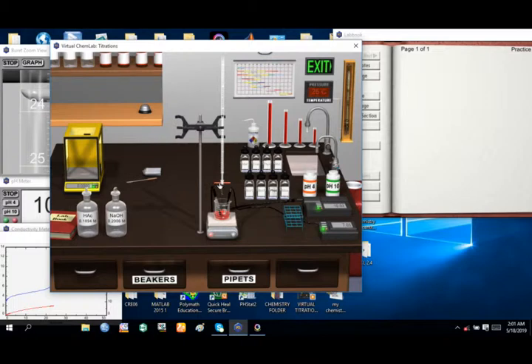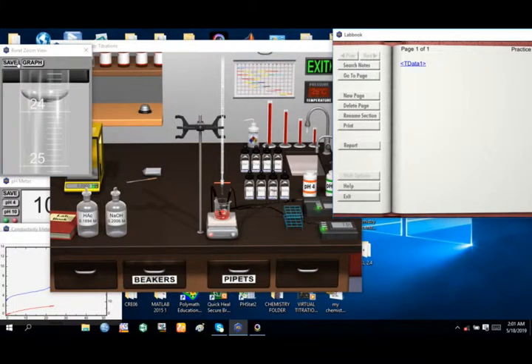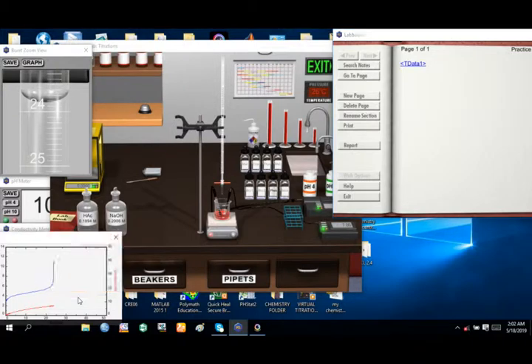Then how do we record the data? We now move to the zoomed menu. This zoom menu is the burette, and click again, stop. It will save the data. And this is the save data. The save data is blue here. Now, you can come up again and see the plotting of the graph.